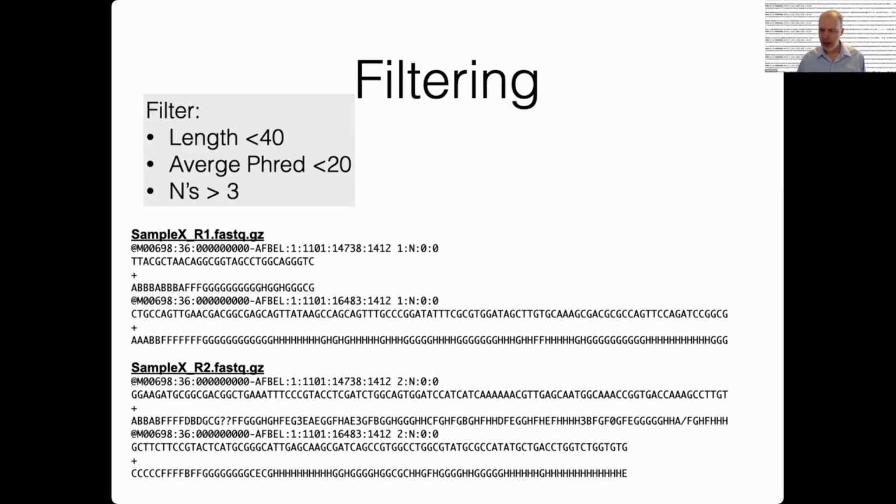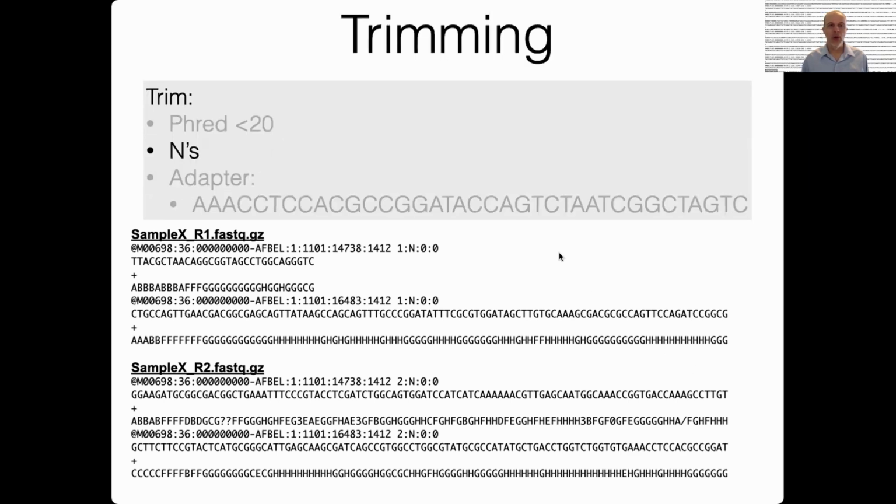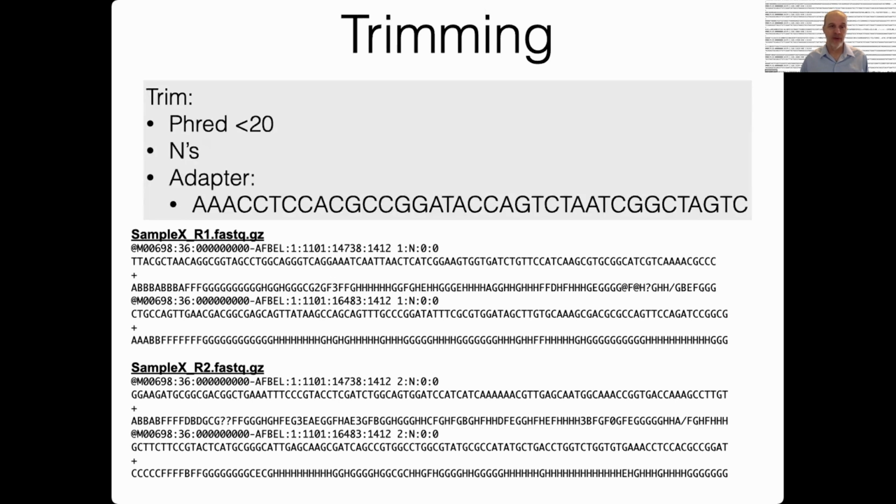So now, there's a question: how to handle the A with the low quality. The standard way for any trimming is that you trim the base or bases that are problematic and anything 3' of it. So here's the base that's problematic. I'm highlighting the quality scores. I don't remember what Phred score this corresponds to, but it's definitely less than 20.